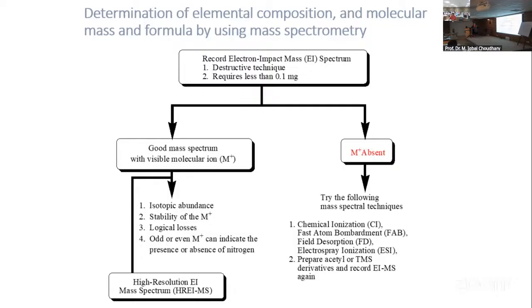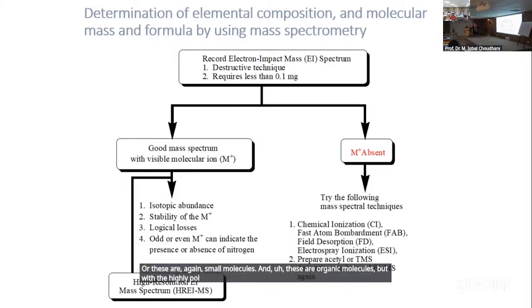D2O. Yeah, if your compound has several sugars attached to it, then it will not dissolve in methanol, right? Then you need to dissolve it in D2O. These are again small organic molecules, but with highly polar compounds, you need to use D2O.